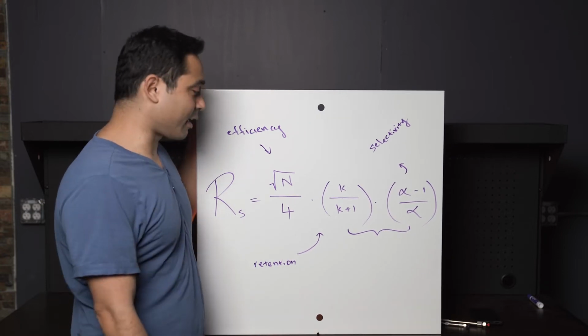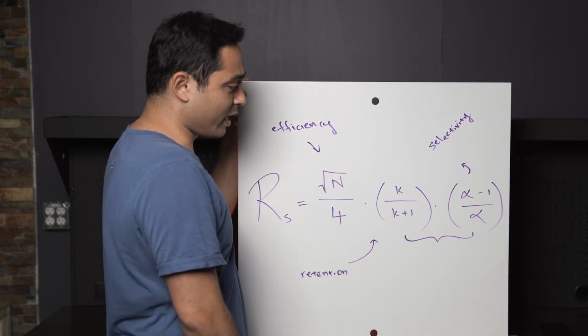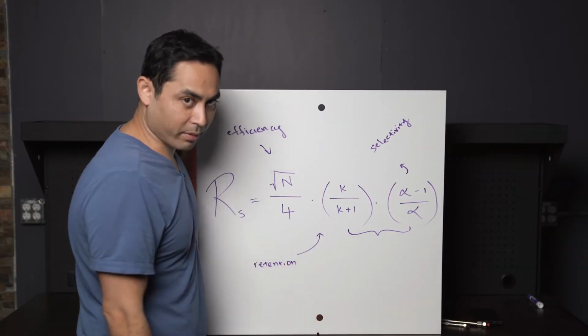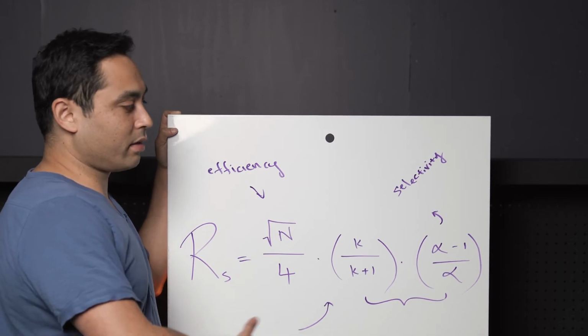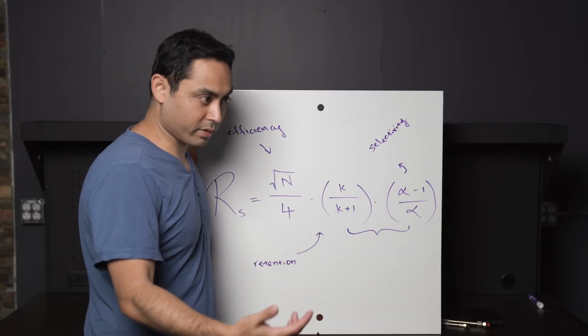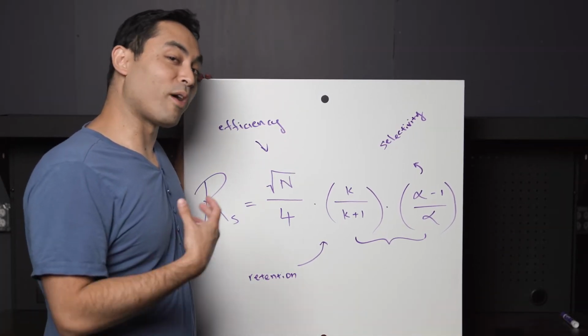At the end of the day, does having a UHPLC and having more efficiency help? Yeah, it definitely does. It's not to say it doesn't. Oftentimes people focus on this way more. They focus on picking the right column chemistry and just getting a good separation. There are a lot of drawbacks that people don't think about when they buy a UHPLC instrument, because they're just like, well, it can do everything an HPLC can do, but I can also squeeze more plate counts and get more resolution, right?